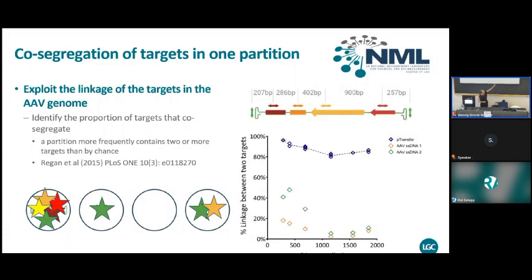So what I've got here is I'm just showing it with the plasmid at the top, because we know that the plasmid should be 100% linkage. And along the x-axis, it's fallen off slightly, but that is the distance between the two. So I've just popped the schematic up at the top so you can see that there's varying distances between them. And ultimately what we get is a really nice curve where it plateaus off around about the 80% of having those full-length molecules.